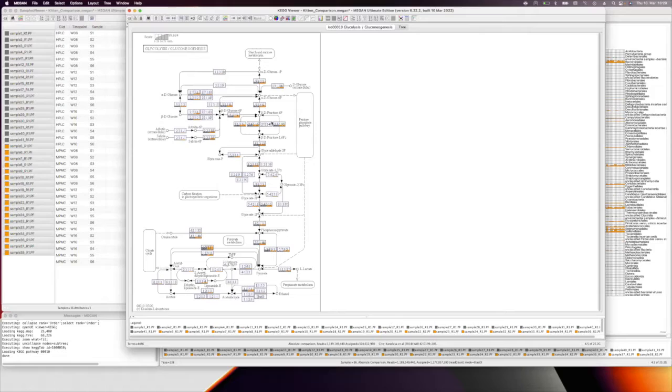But you can also use this to look for enzymes that are differentially abundant. For example, I can't see one in this here that is only ever present in one, but for example, this here, the orange bit is a lot larger than the gray bit. In this one here, there's only orange and hardly any gray. And you can use the different scaling here. So the counts are currently scaled on a square root scale.